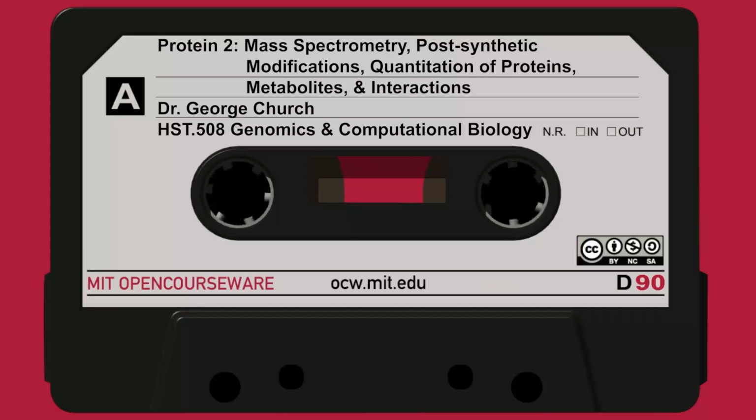And so if you look at this, as you look at essentially the protein fingerprint for each of the 60S fractions in the sedimentation, they look pretty similar, and when you run out the mass spec, you get similar sets of peptide signatures, and most of them, especially the most abundant ones, correspond to the known 60S proteins. If you go a little bit slower, less mass, the 40S subunits, and you analyze the sequences, so the mass spec signatures for those peptides, they mainly turn up 40S. And there's some exceptions in both. There's some other categories which may be interesting.